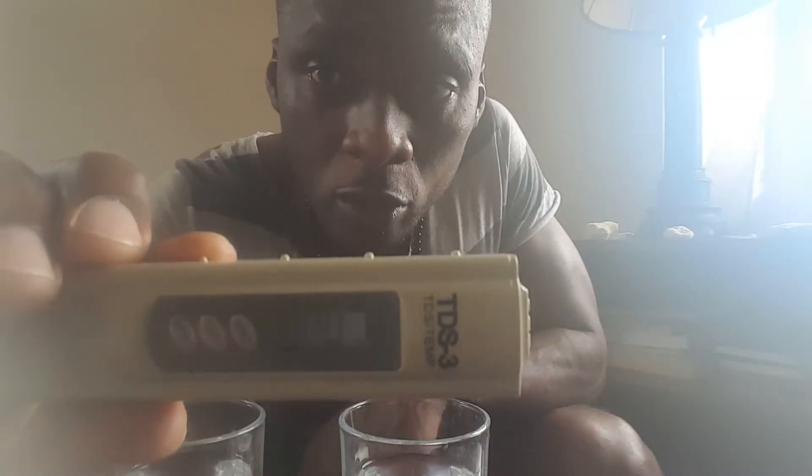I'm gonna start off with the rainwater. I'm gonna turn this on — okay, you can see it's at zero. I'm gonna stick this in here and press hold.